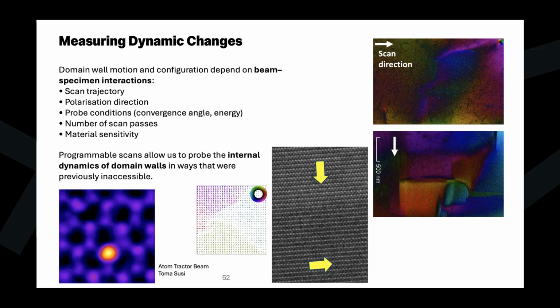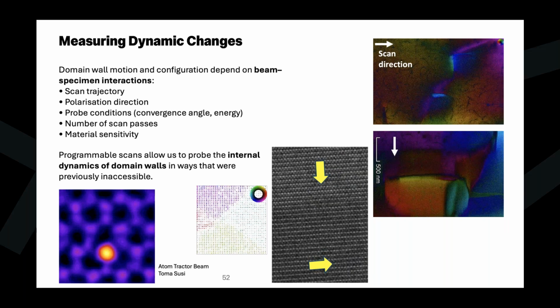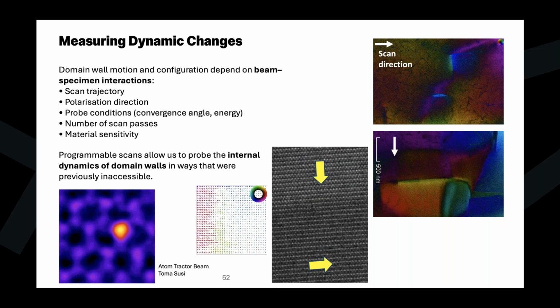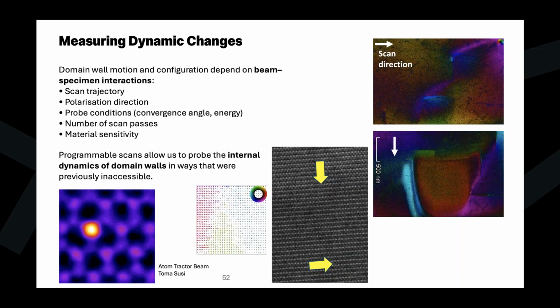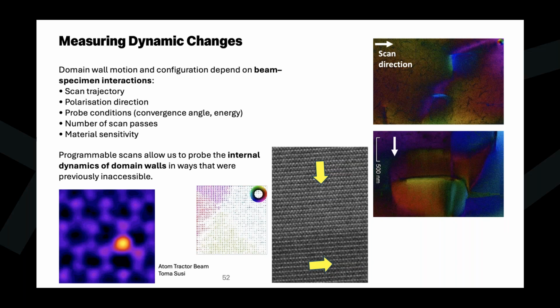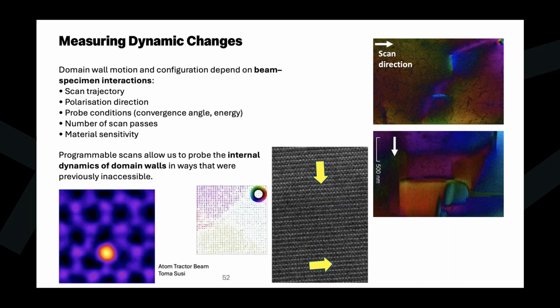And so where we've come at the start from is that we knew that if we moved our STEM probe in different directions, using classic, just rotating the scan direction, we could move these domain patterns. You can see in the atomic resolution video at the very bottom of that same material that we can actually map this motion atomically as well.